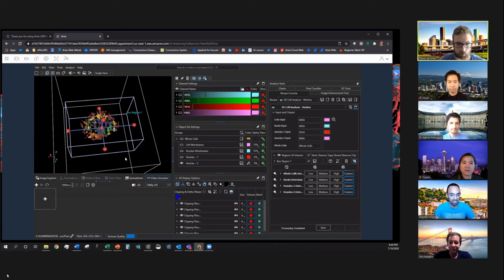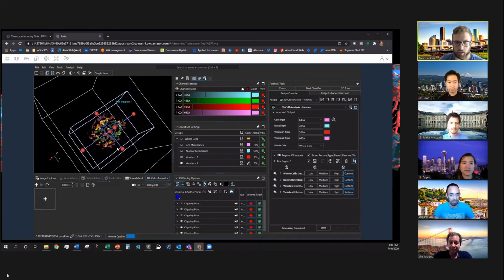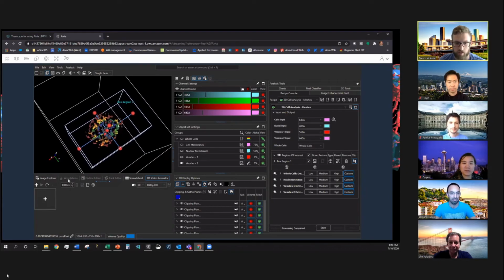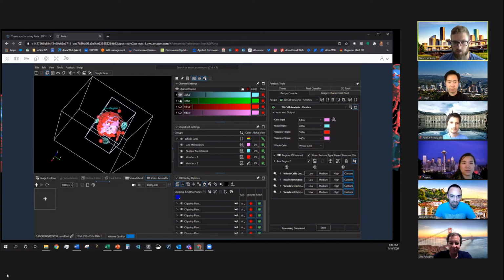And whenever you explore how to visualize the data, it's usually a good time to spur some discussion about what the data actually shows. So now that I'm controlling the screen, I might pull this up and try to find a creative way to show what Luciano has made. So I think what I'm going to try is show these cell membranes and the nuclear membrane. Go ahead and show all the vesicles, and I might want to start with completely opaque membranes, and maybe start with a bird's eye view of the data, turn on some channels.